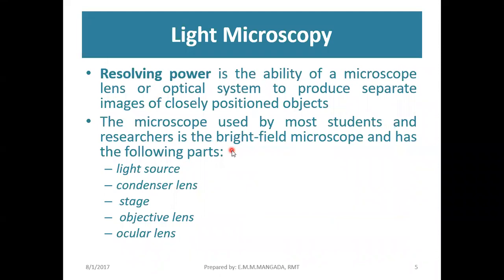Okay, so we have here the properties, okay, of our light microscope. So we have what we call the resolving power. So guys, when we say resolving power, we're talking about the smallest detail, okay, that a microscope can resolve. So yung pinakamaliit na detalye na kaya niyang i-resolve. Like for example, yung sabi ko nga kanina sa inyo, yung dalawang object na magkadikit.